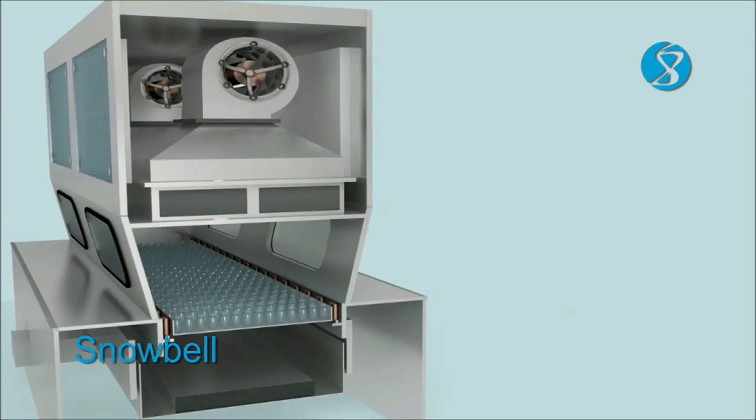The temperature and even distribution of air in the cooling zone ensures the vials exit at a temperature of 25 degrees centigrade. The length of cooling zone is designed sufficiently long enough to prevent thermal stress to the vials. Vials exiting the tunnel are fed to the downline machine.